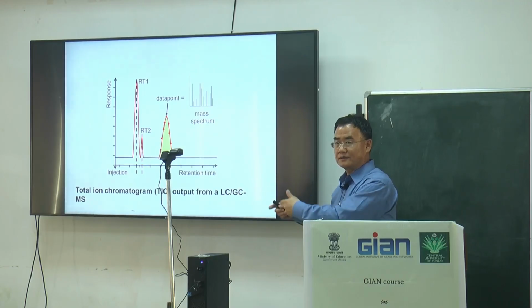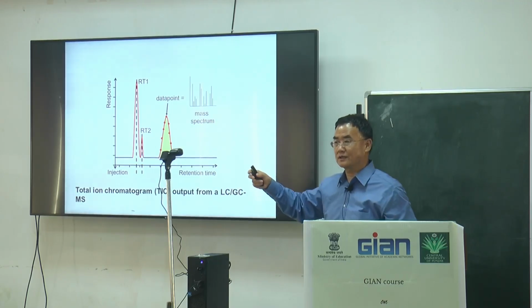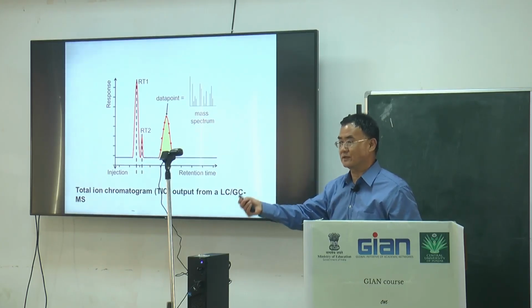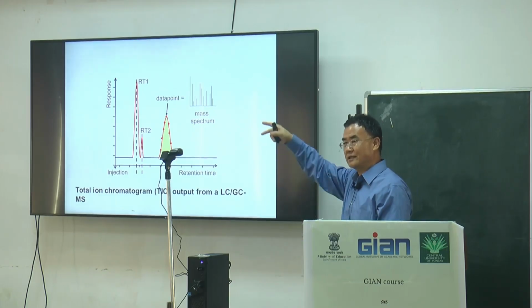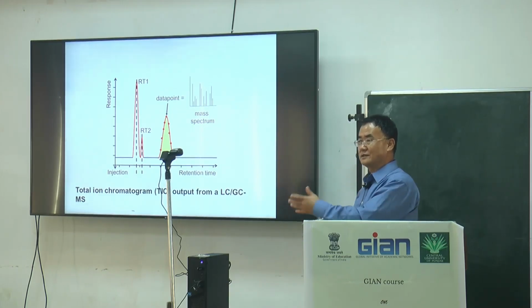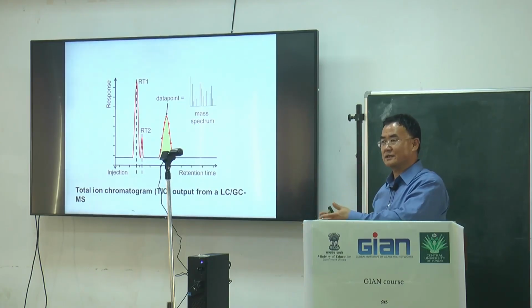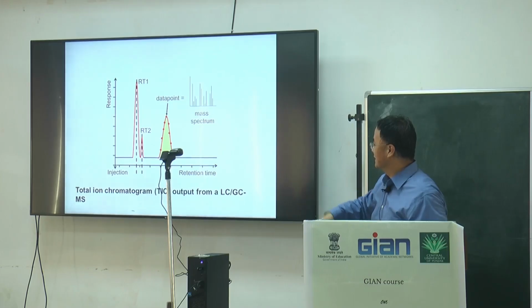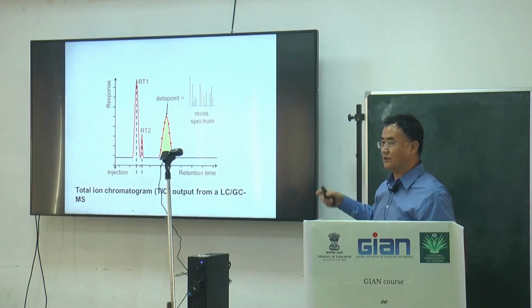First, you can do the TIC comparison from different tissues, for example root, stem, and the seeds. You can get the full idea. Under the same identical condition, the different tissues have different chromatograms of the total ions.